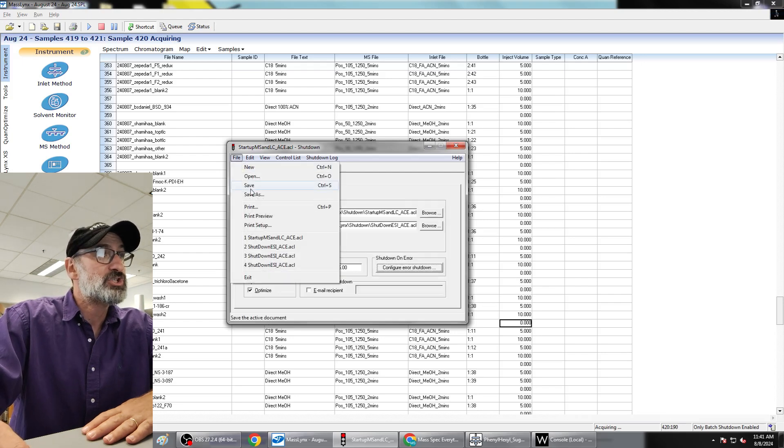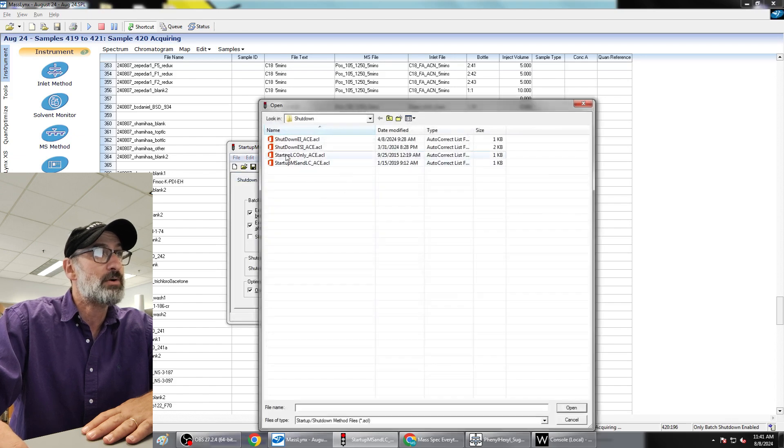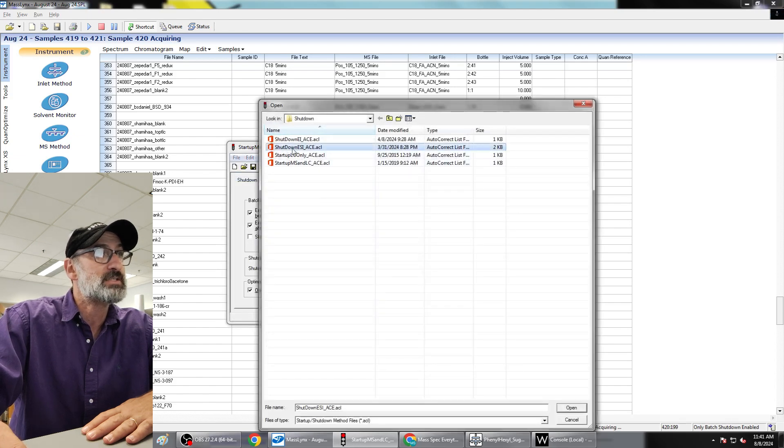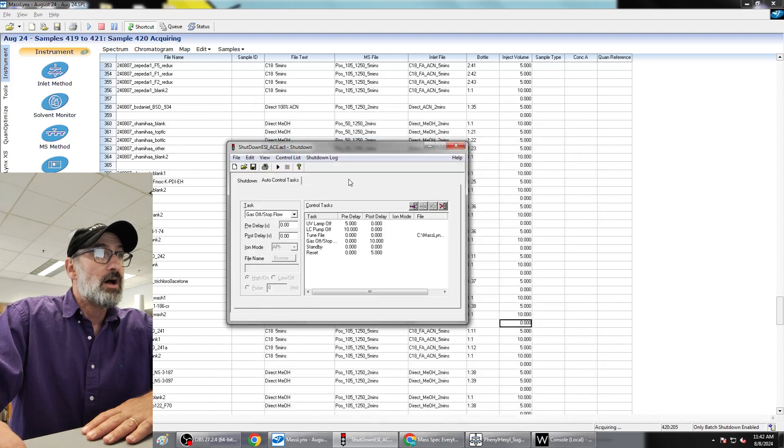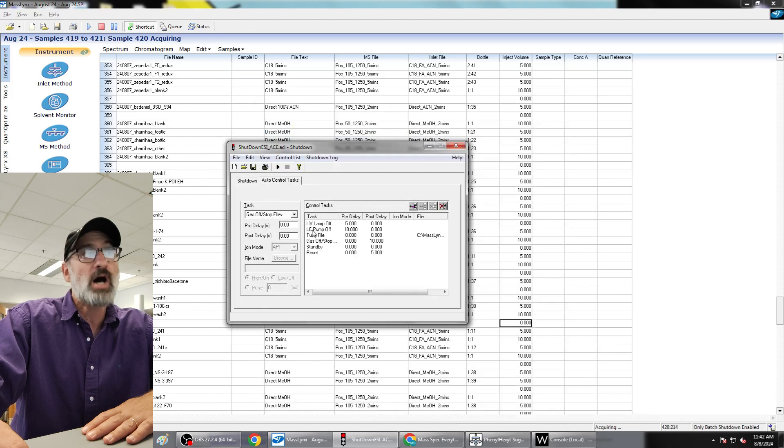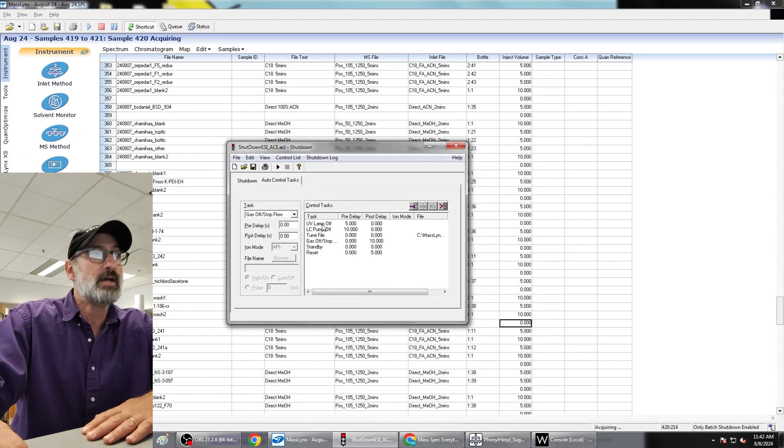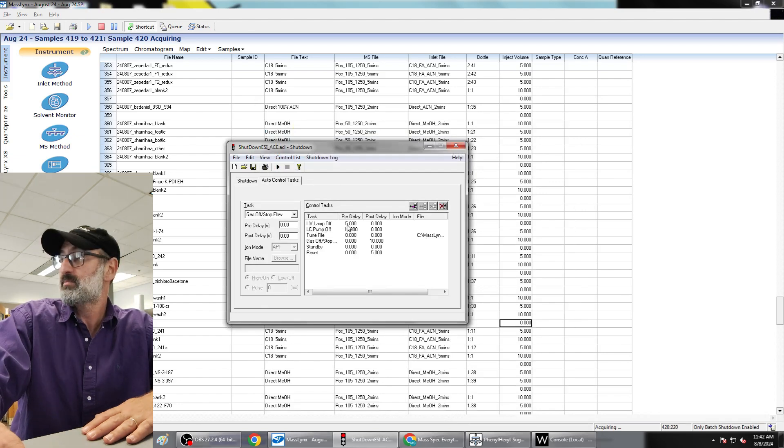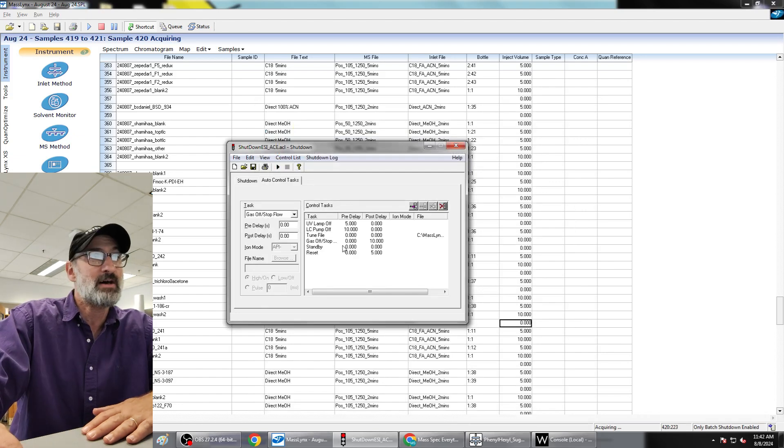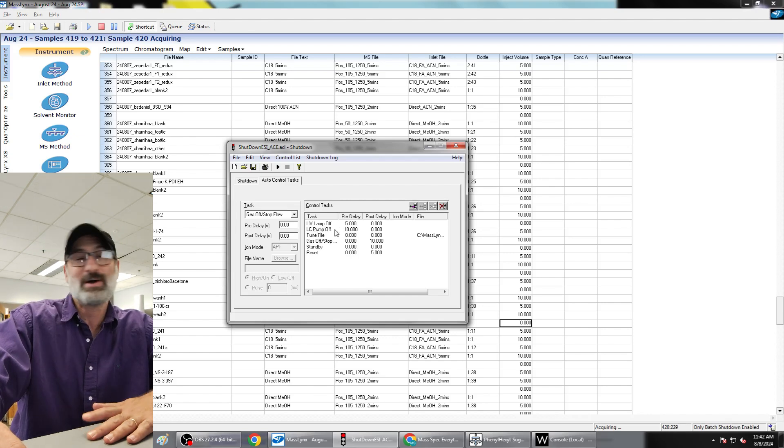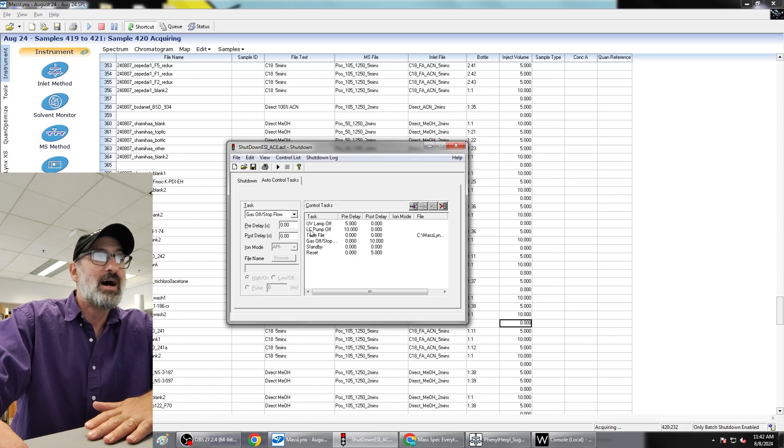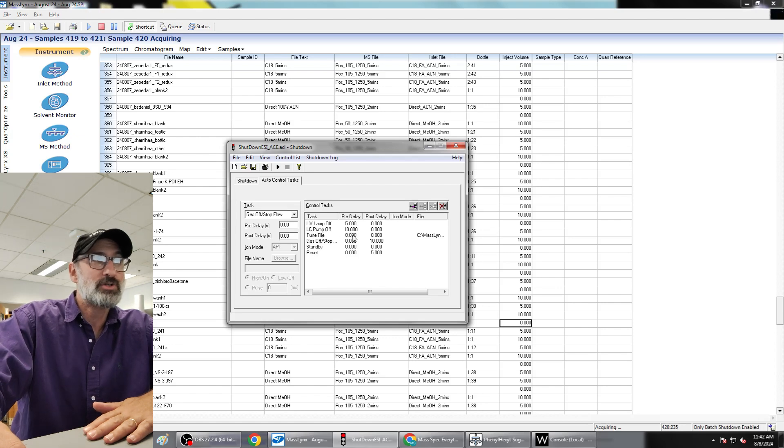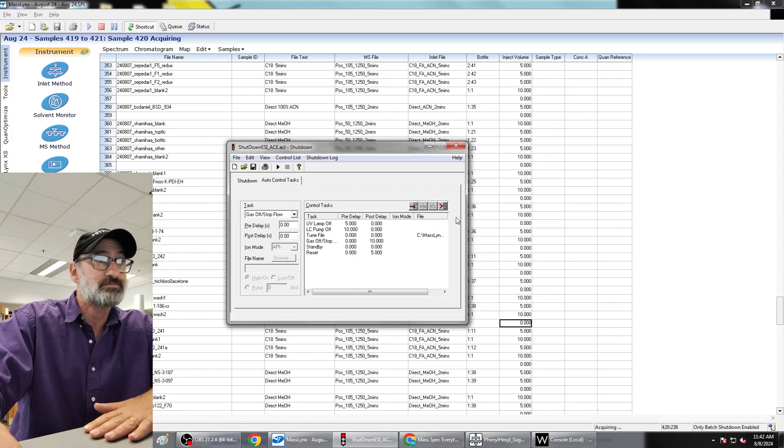So now the shutdown. The shutdown is going to be the reverse order. So now we're doing the shutdown ESI and ACE auto control tasks. So again, we're turning the lamp off now, not on. Lamp off five seconds before everything else. Ten seconds before everything else. I guess those are out of order, we probably should have done that the other way. The LC pump will turn itself off, so turn the pump off first.